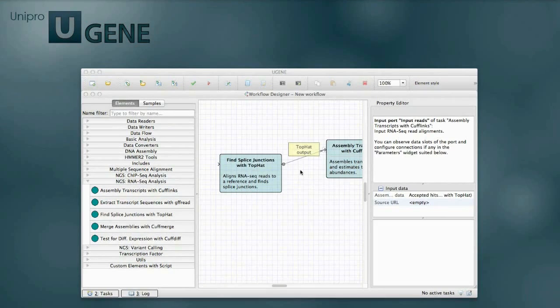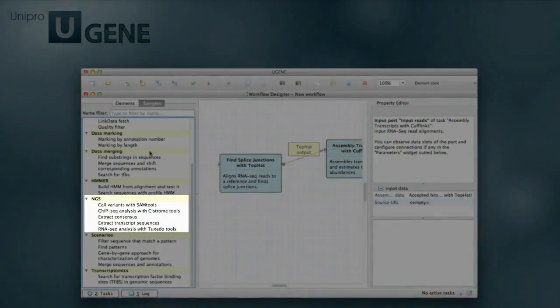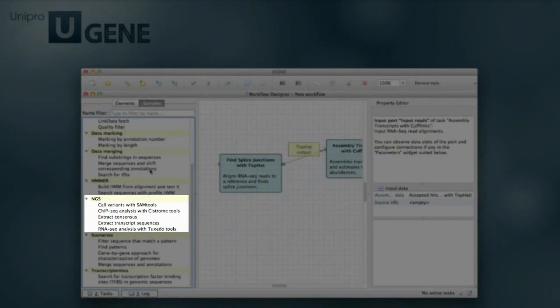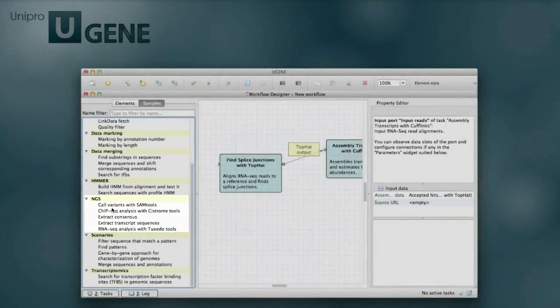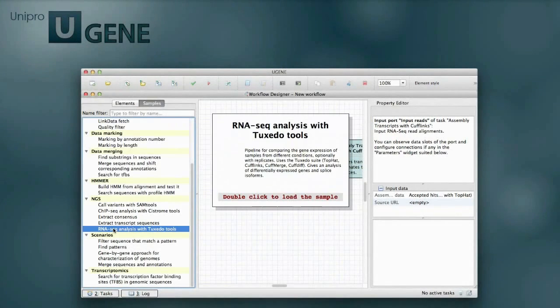There are ready-to-use samples in the workflow designer. The NGS pipelines are located in the NGS section of the samples. By double-clicking on a sample and supplying the input data, you can run a pipeline with default parameters and outputs.